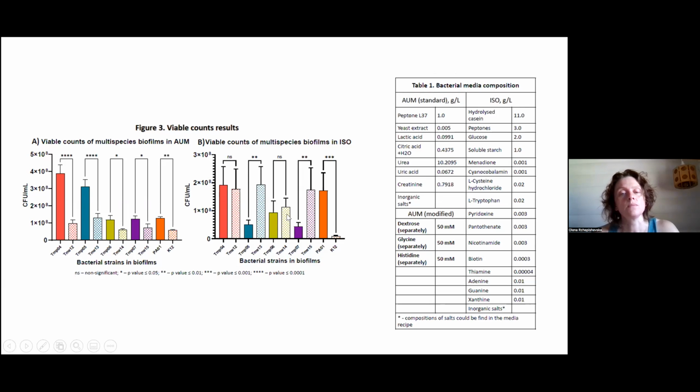Here is the same, and in this purple pair, Escherichia takes over, but in the control, Pseudomonas grows better. But this is a lab control. Here we were comparing clinical strains with lab controls, and it seems like the lab control doesn't behave the same.